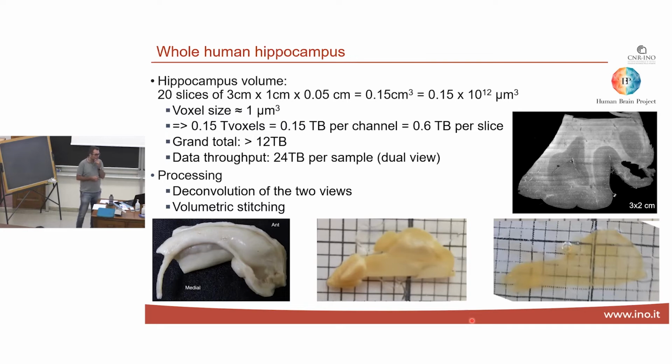that was imaged using the inverted light sheet microscope, because it is useful for samples that are large sections. Of course, we had to cut the sample anyways. We had to cut it, but still the sections that we make have a finite thickness of 1 millimeter or 0.5 millimeter. So we can still do three-dimensional imaging of the slice, even if in some cases we have to cut the sample, but not, for example, with the mouse brain. The mouse brain is intact. Or we also do the whole mouse heart, for example, an intact and entire mouse heart. We've done it, without cutting the organ.